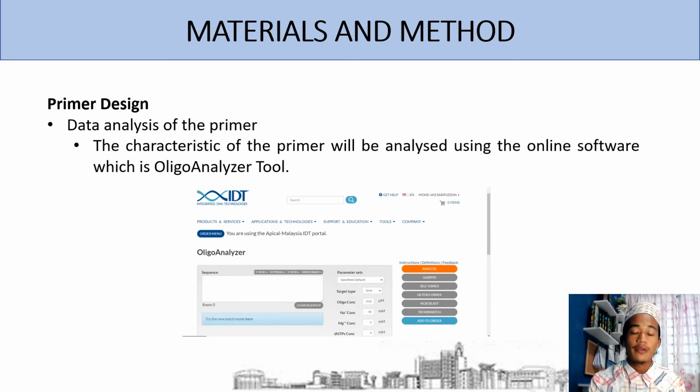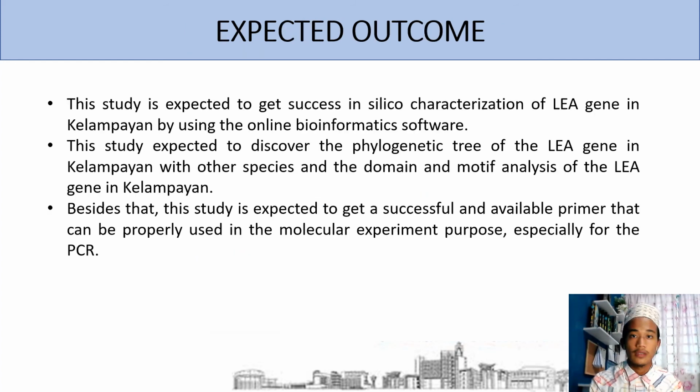After the primer is obtained, the data analysis of the primer will be done. The characteristics of the primer will be analyzed using the online software, which is the OligoAnalyzer tool. As we can see here, the hairpin structure of the primer can be investigated using this software.